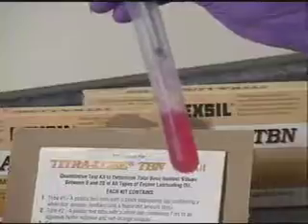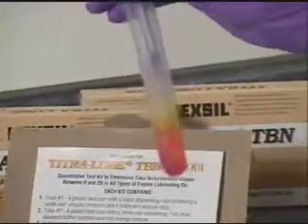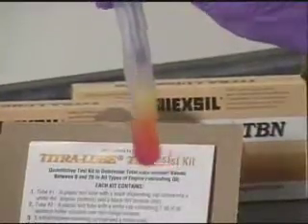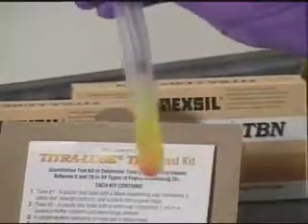Add each drop slowly, and when the magenta color turns yellow-red, add one more drop of titrant. The color should be bright yellow, then stop.